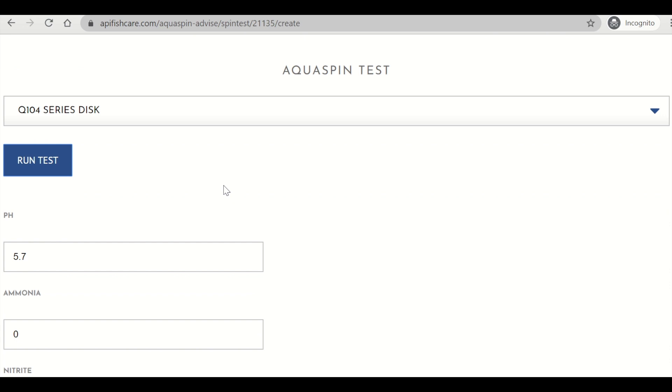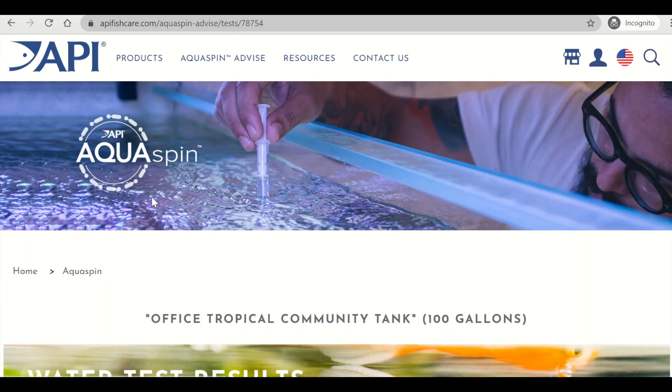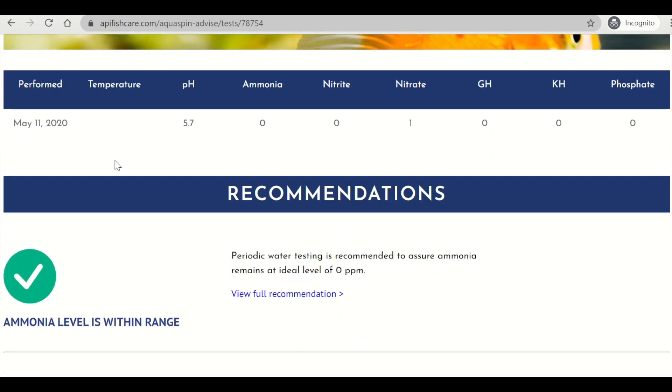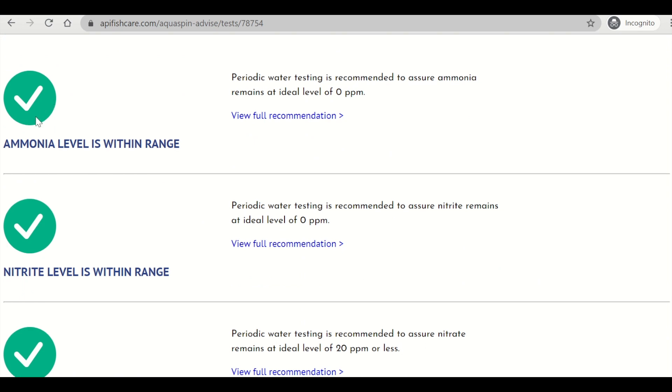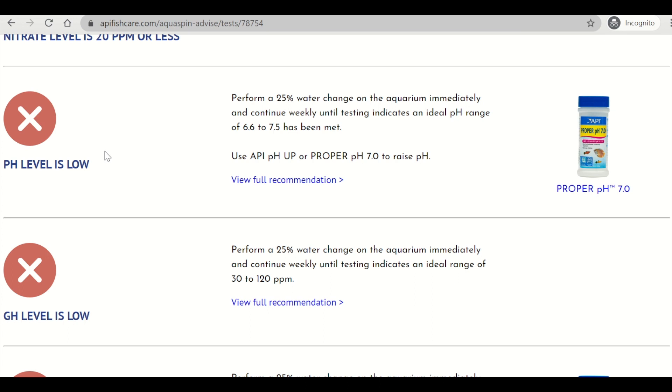Here you can see all of the parameters tested have been populated. Click save results. This will take you to the results page as well as the API product recommendations page. It will list out every parameter with the product recommendation if there is one. For parameters with green check marks, that means your water is within range and no necessary actions are needed at this time. If your parameters show an X icon, it means your water parameter is out of range. With this, you are given instructions as well as the product recommendation to make your water safe and put it back into the range for that specific tank.